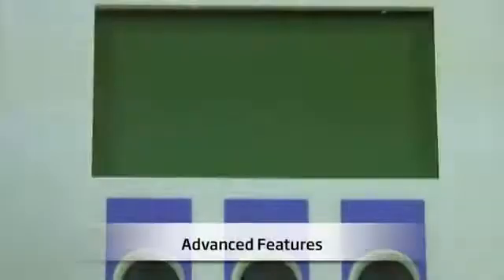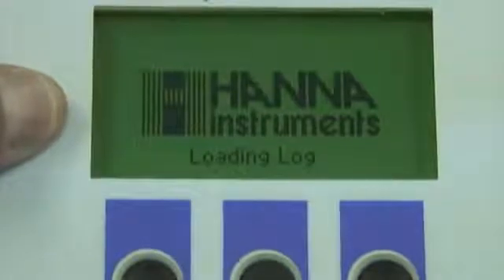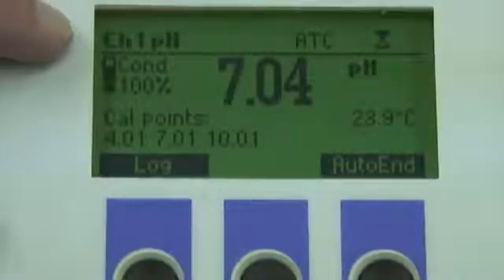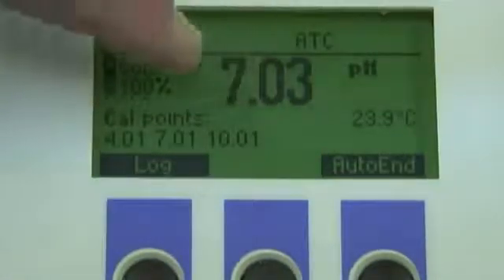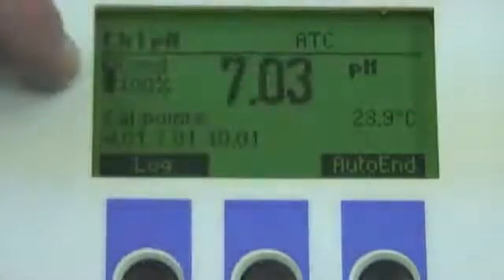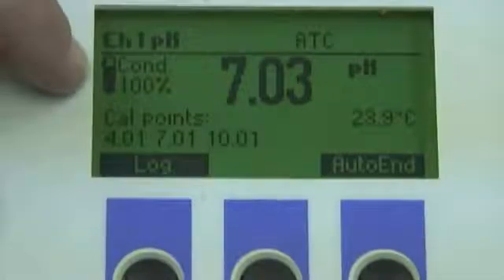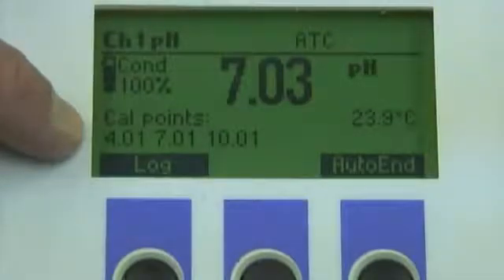Next, I'm going to turn the meter on and show you some advanced features. Once the meter warms up, the LCD is going to display a lot of different information. It's telling us that we're on channel one with automatic temperature compensation. The solution I'm measuring has a pH of 7.03 with a temperature reading of 23.9 degrees Celsius. A great feature is that I can actually see the condition of the probe after calibration — in this case it's at 100% and I've calibrated with buffers of 4, 7, and 10.